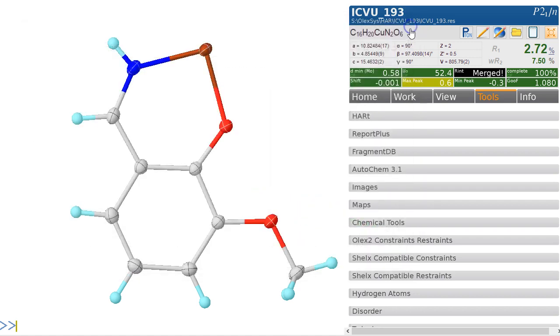If we have strong high resolution data like this and look at the Q peaks (control Q), we see these peaks actually all sit on the bonds. That is because these atoms have been modeled as spheres—we're using spherical form factors. Of course, the electrons are not distributed spherically around the atom but they're making bonds, so we're not accounting for those electrons.